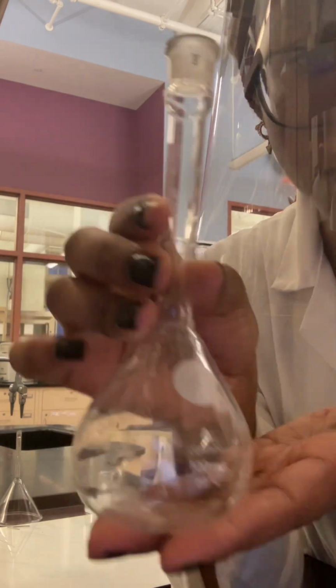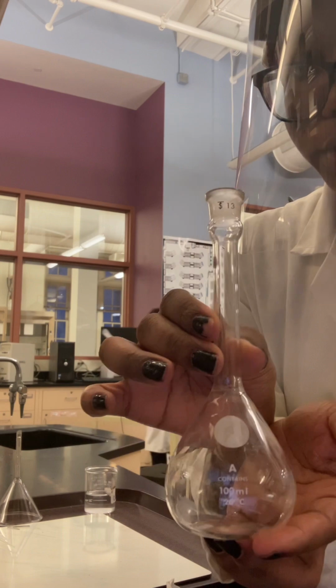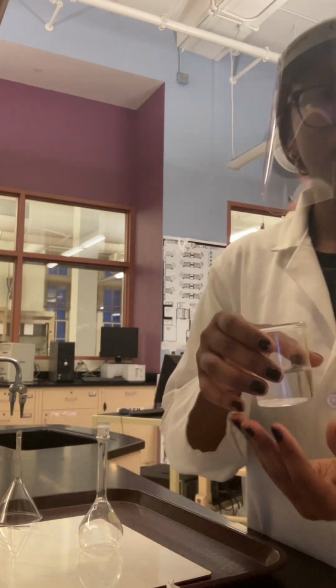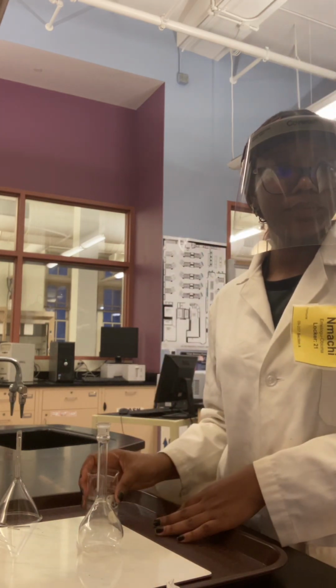I will be using the 100 milliliter volumetric flask. And this is the beaker of salt and water solution that I used in the analytical balance experiment.